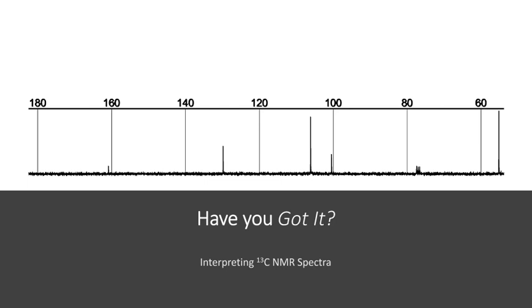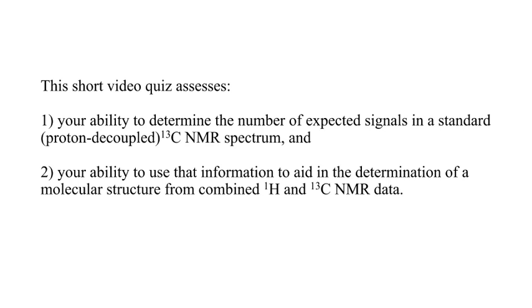Interpreting C13 NMR spectra. Have you got it? This short video quiz assesses your ability to determine the number of expected signals in a standard proton-decoupled C13 spectrum, and your ability to use that information to aid in the determination of a molecular structure from combined proton and C13 NMR data.